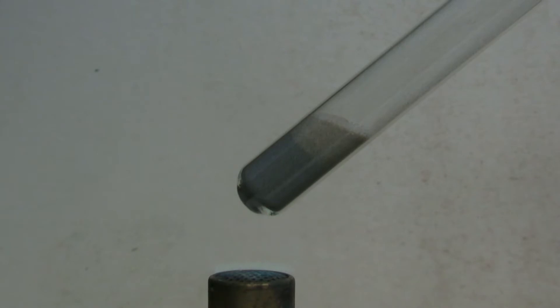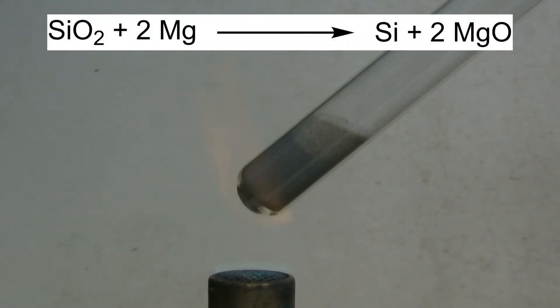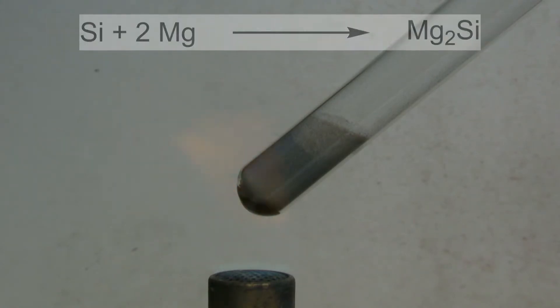The mixture is then heated with a Bunsen burner until a reaction takes place. The magnesium reduces the silicon dioxide and silicon and magnesium oxide are formed. The silicon reacts with additional magnesium to form magnesium silicide.